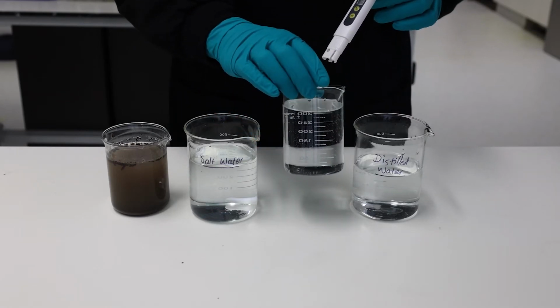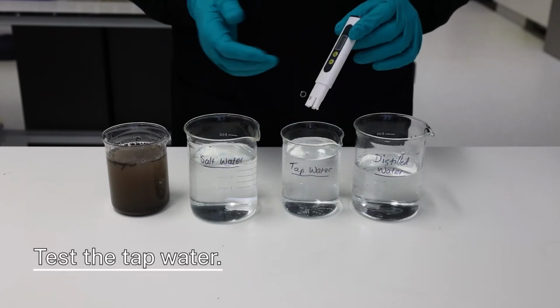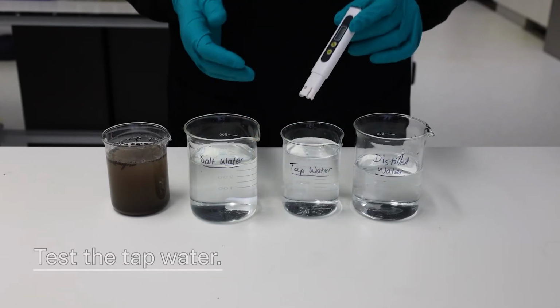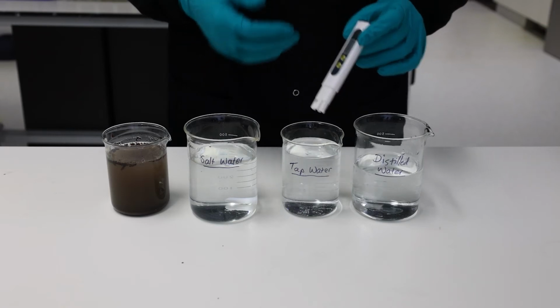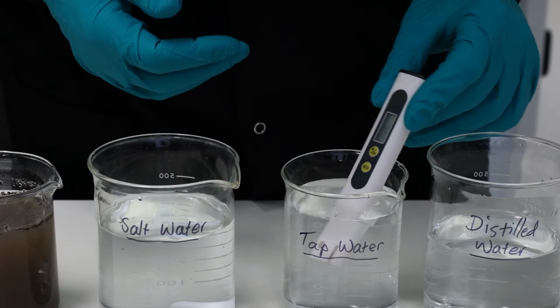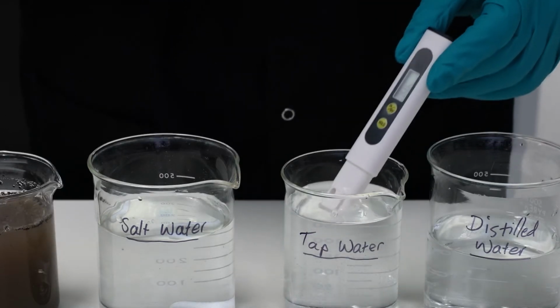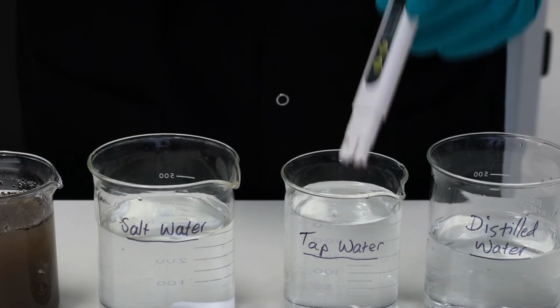Next, we'll do the same and measure the conductivity of some tap water. Try testing the water from different taps, such as the kitchen or bathroom, and then from an outside tap, and see if there are some differences. Here, we get a reading of 46. So still very low, but higher than the distilled water.